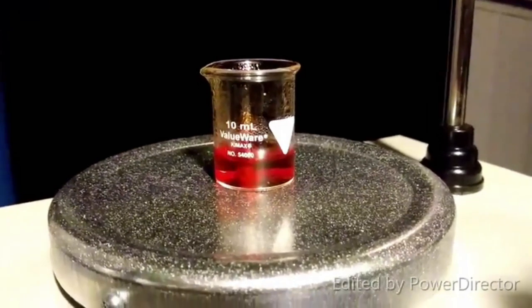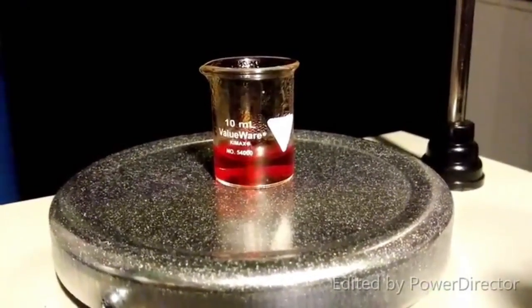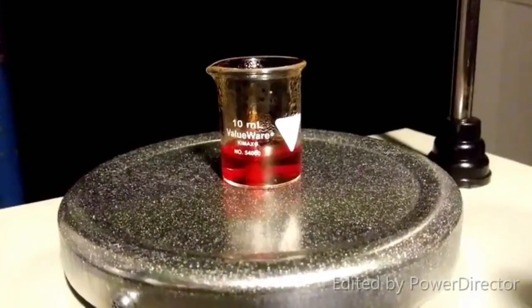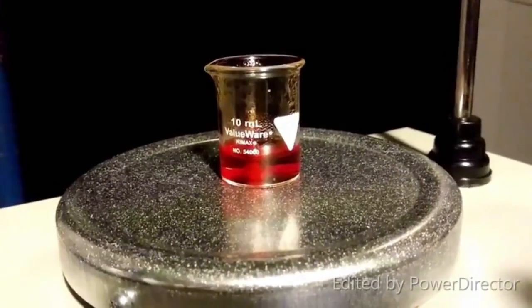Cool. So I'll try to get a crystal film of this and see if we can get some good pics of that one. The potassium iodide platinum tetraiodide crystals turned out very well, so fingers crossed these do too.